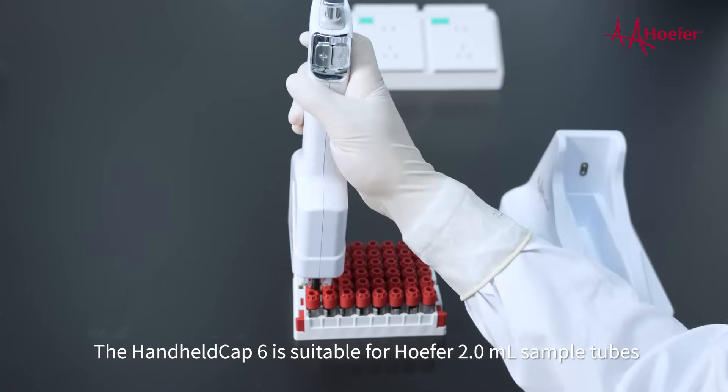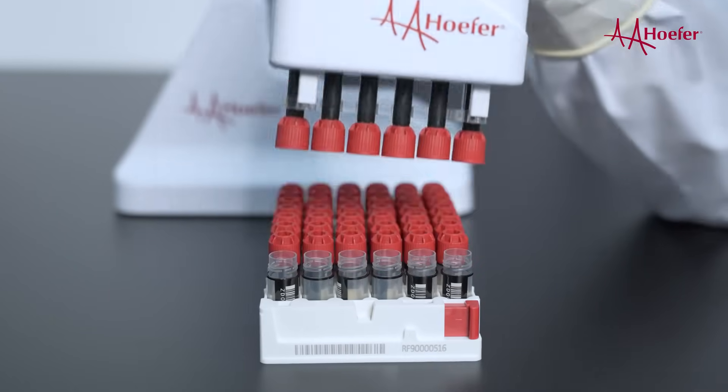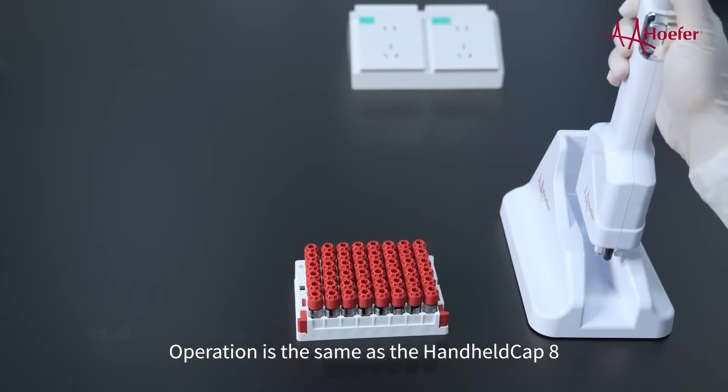The handheld cap 6 is suitable for holder 2 milliliter sample tubes. Operation is the same as the handheld cap 8.